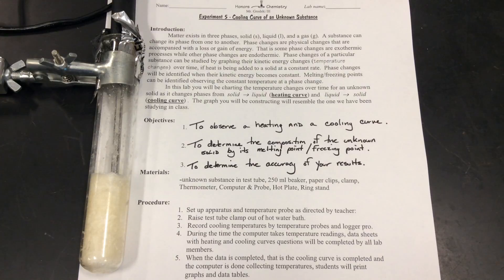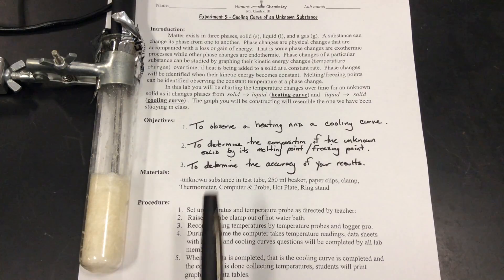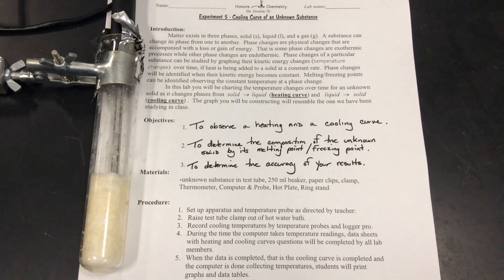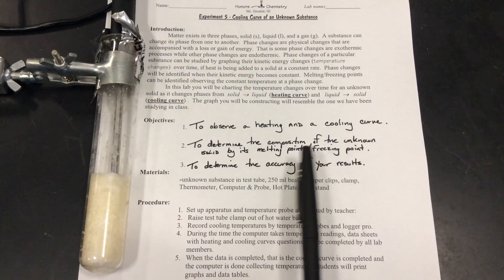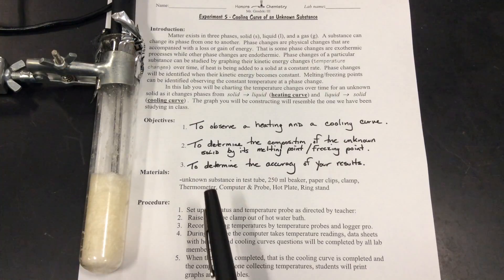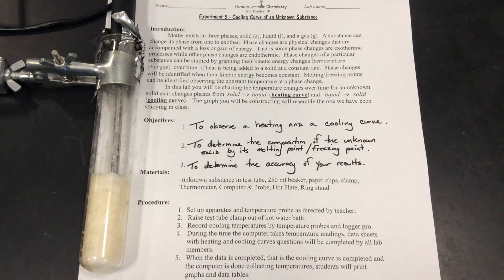The second part of this, once we have graphed this, once the computer has graphed it in real time, we're going to mark up that data and we're going to determine the composition of the unknown by figuring out what its melting and freezing point temperature is. That's the temperature that stays constant, that flat line where the kinetic energy doesn't change. We're going to get that right from the graph, and once we get the melting and freezing point, we're going to go to a list of known values and see where this substance is closest to. Then we'll do a percent error, which we all know is measuring the accuracy of our results.